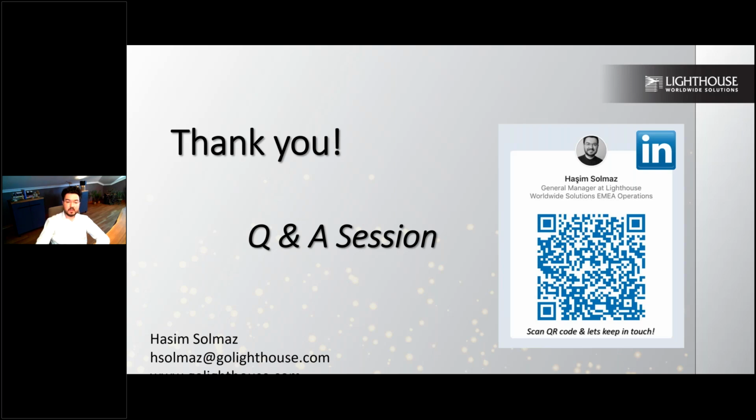It's not recommended. If you are not taking the necessary precautions or actions to do a root cause analysis, increasing your action level is not a real solution. Your problem will still be there, but you'll be taking it under your action level. So technically you will be ignoring it. That's why it's critical to have a better understanding of how you set up your action level and how you will be reacting to these levels.